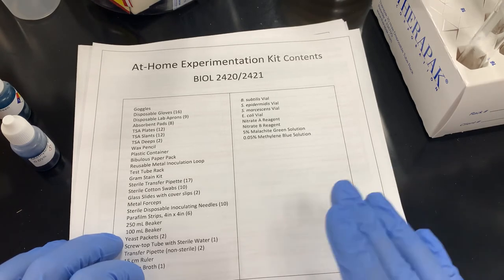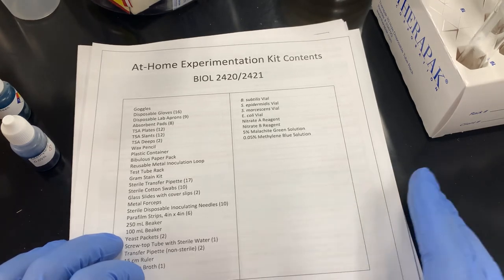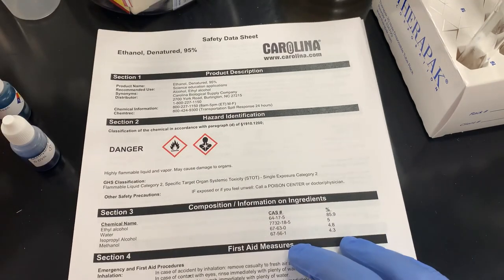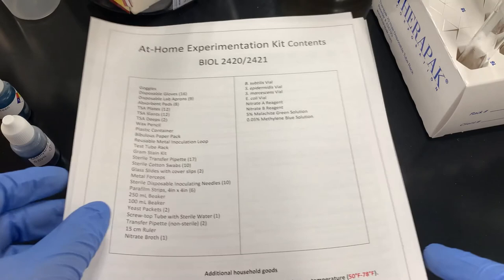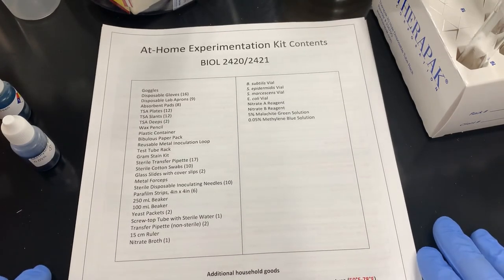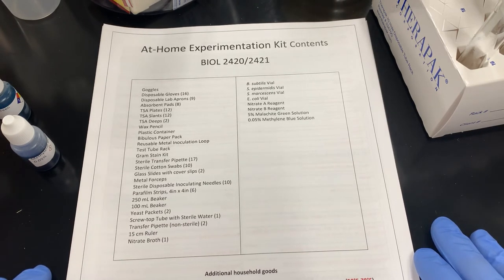It happened to me, spills happen. Just make sure that you have read your safety data sheet for each of the chemicals. You know what precautions to take if you get it on your skin or in your eyes or you accidentally digest it. Chances are you are not going to do any of those things. However, accidents do happen. Make sure you know how to treat them, okay?